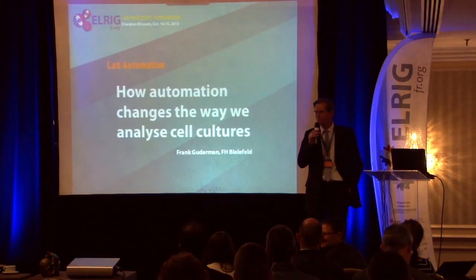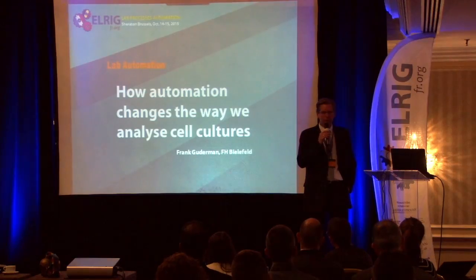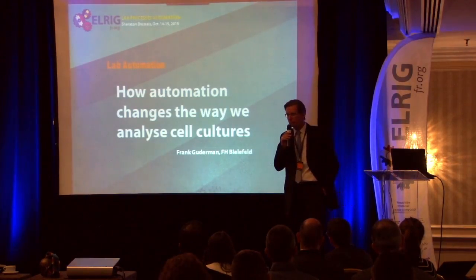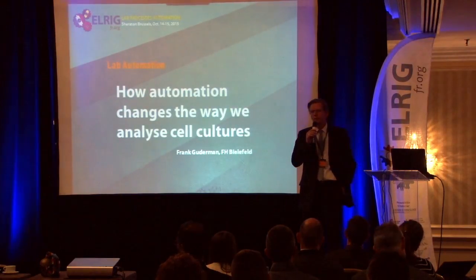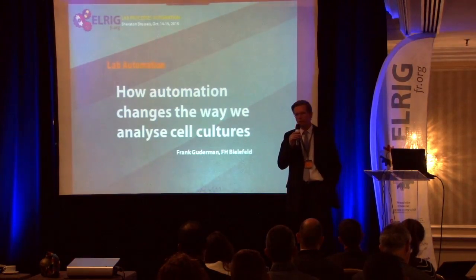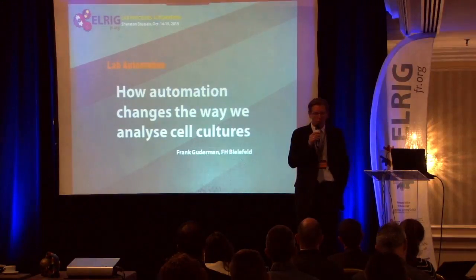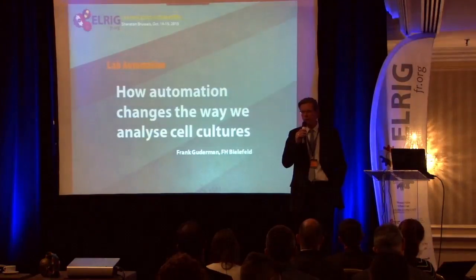Yeah, that's a good question, because as this was a prototype and everything was built from scratch, it took 3 people more than 4 years to program what you just saw. But of course, there are fundamental things like the scanning device, the laser scanner, to read out the data and to program certain actions. Once you have those actions, avoid an object, for example, was one routine that was very important, of course. Then the other, take a sample out of the bioreactor, grasp a sampling vial.